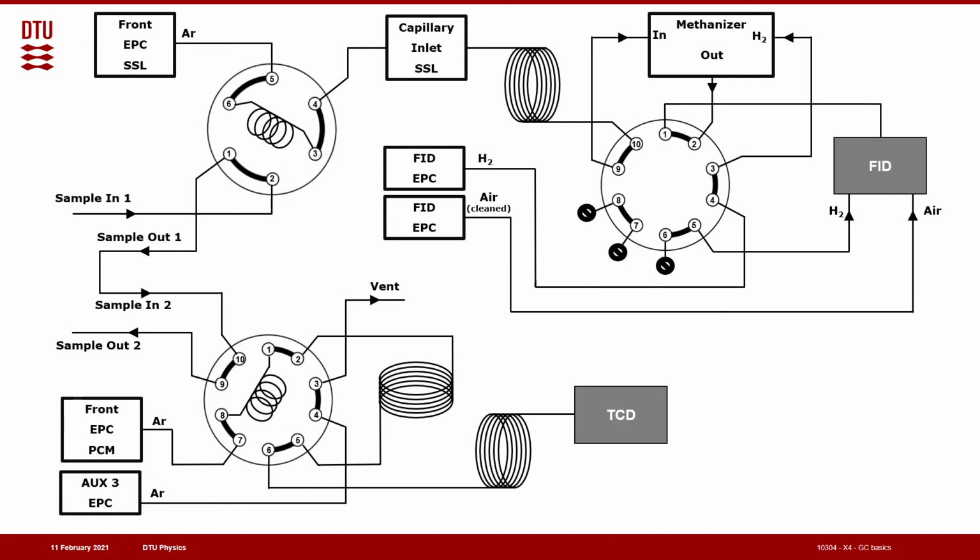We start at the injection time, running both these valves. Now the sample runs in, so it's the same sample taken from the same gas stream. And now we're running in a time that is parallel to the process time. So whatever time we talk about here, retention time, the time it takes for the gases to pass through the columns, has nothing to do with our experiment. You should regard this as you take a syringe and take out a sample and analyze it hours later.